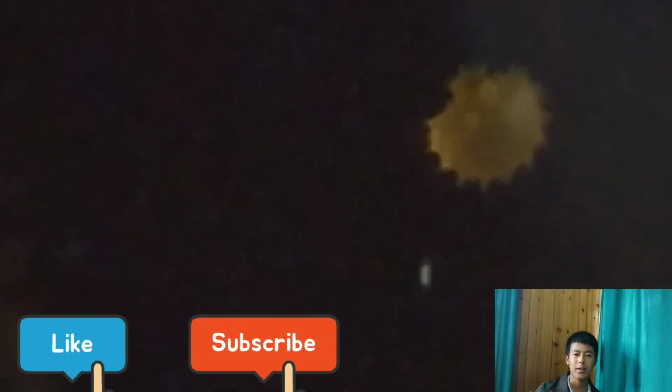So as you can see, they are kind of fun. Watching these pollen grains is fun. I think that yellow sticky thing is the sticky part of the pollen grains, which makes them attach to the stigma of the flower.